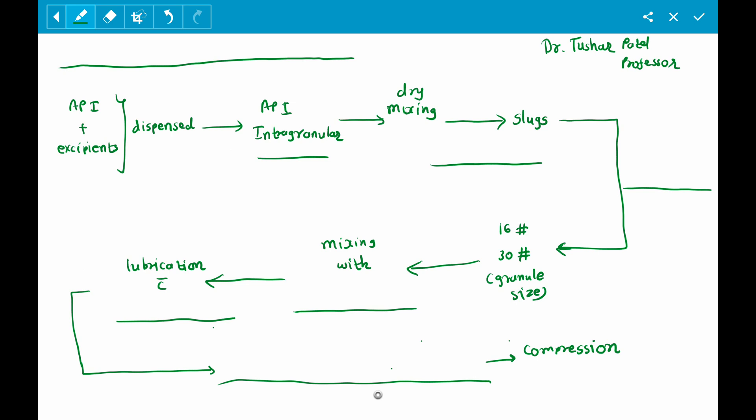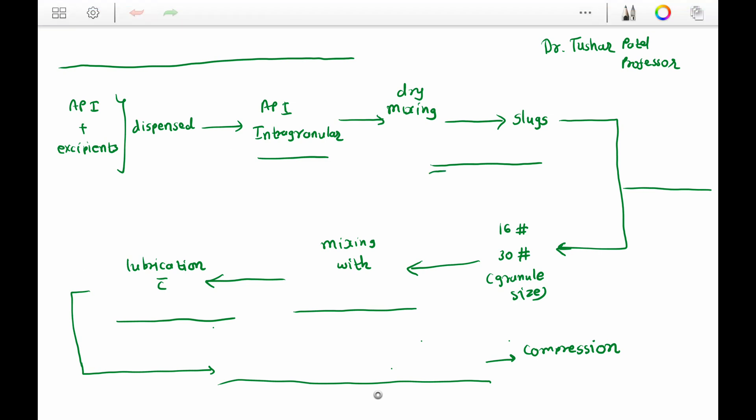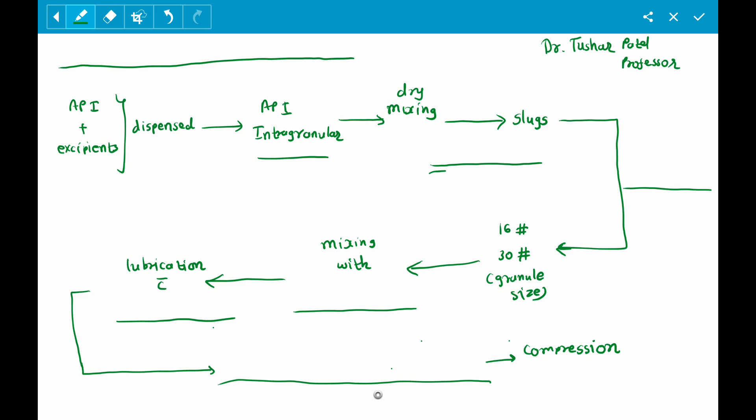To revise: the API and excipients are dispensed, then the API and intra-granular excipients undergo dry mixing. The material then goes through the roller compactor to prepare slugs, which undergo milling and crushing to the required granule size. The granules are mixed with extra-granular excipients, lubricated, and the resulting ready-to-compress material undergoes compression to prepare the final tablet.